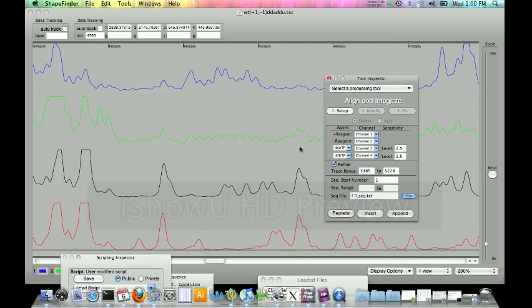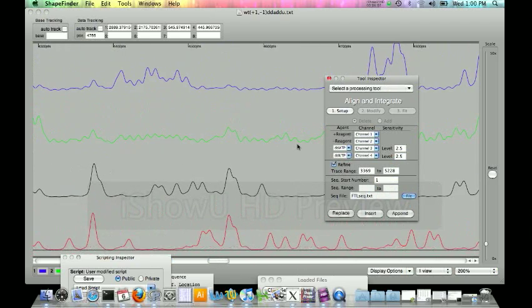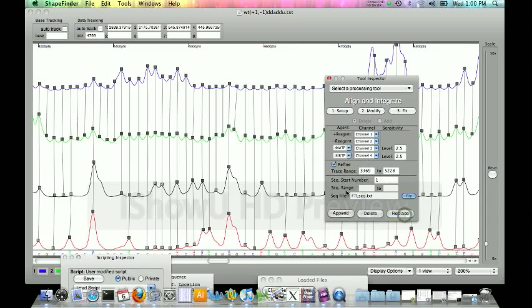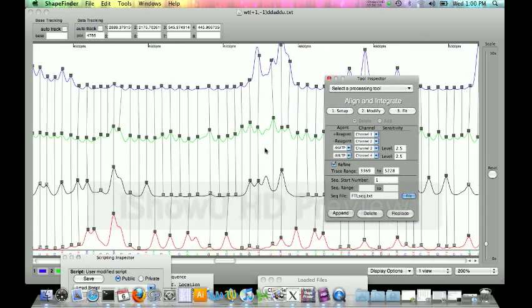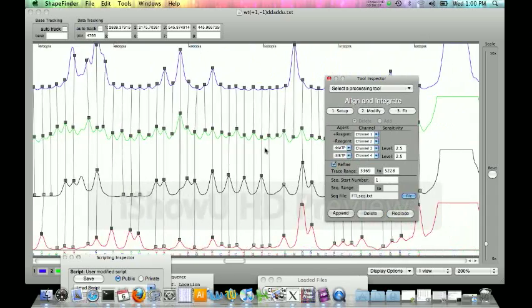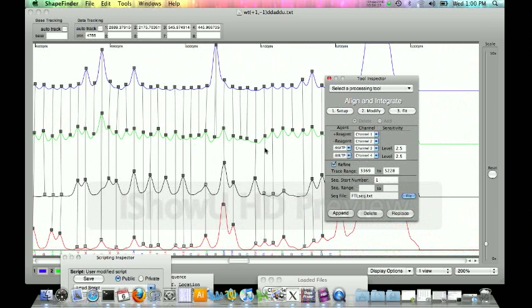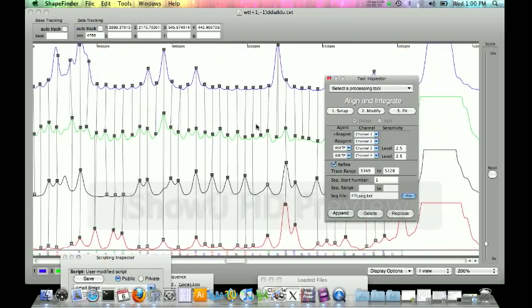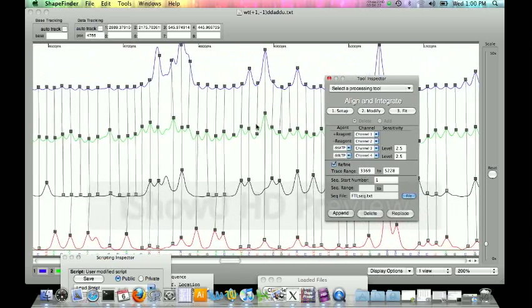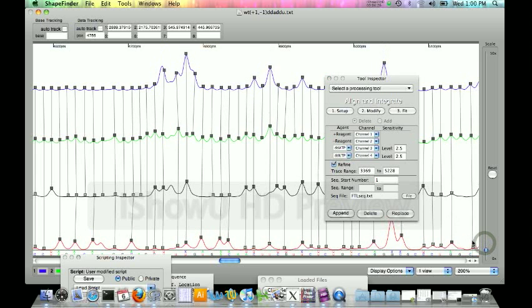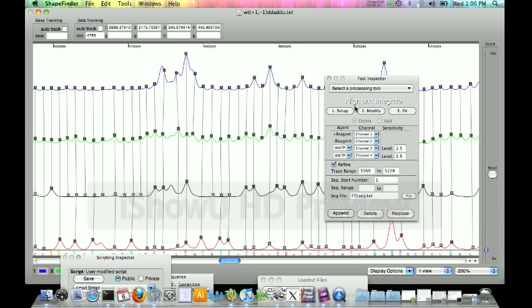What it's going to do is go through and assign about 95% of the peaks to these peaks. So what it did is about 95% of the peaks are there. The computer does a lot of the work for you which is great. The tough part that really makes this analysis hard is going through and fixing the peaks that the computer was not able to find correctly. If you look right here we see some very distinct peaks that the computer was not able to find. We have about three peaks in here that aren't necessarily on peaks.